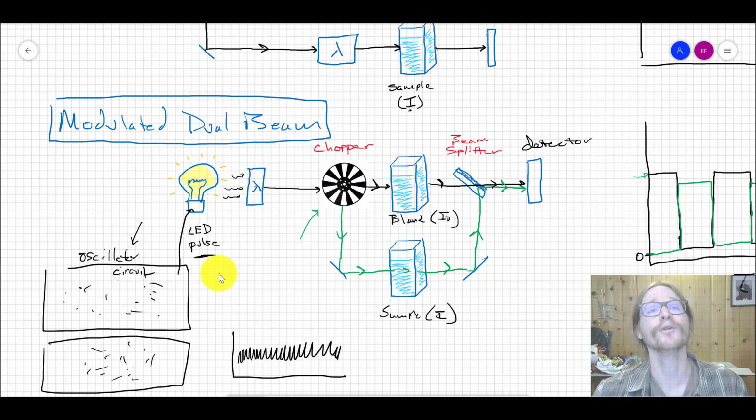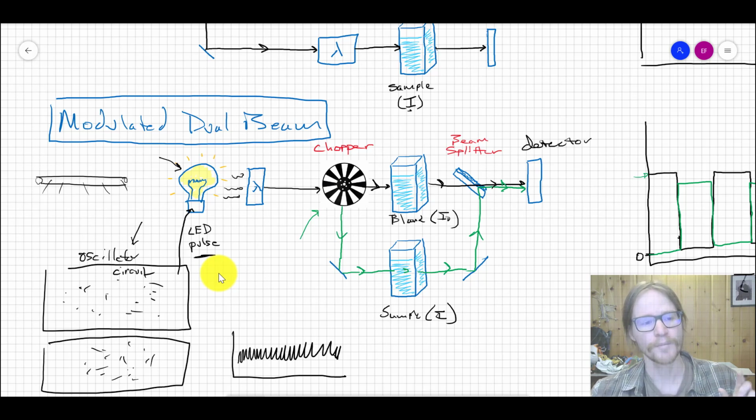What is above you in a lab but these big fluorescent tube circuits? You've got these fluorescent light tubes, and you maybe never really thought about them, but they're emanating light down on you. Turns out that they're not emanating light in a way that's continuous like a bulb would be, but they're actually oscillating based on the AC frequency of the American system, which is 60 hertz.